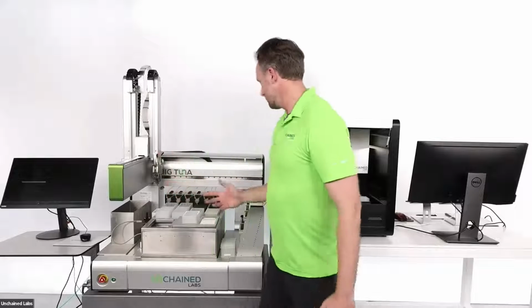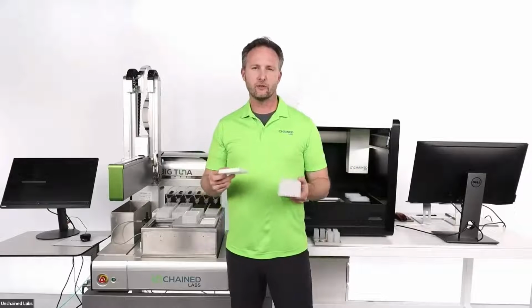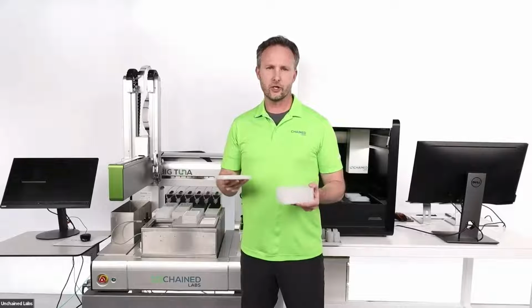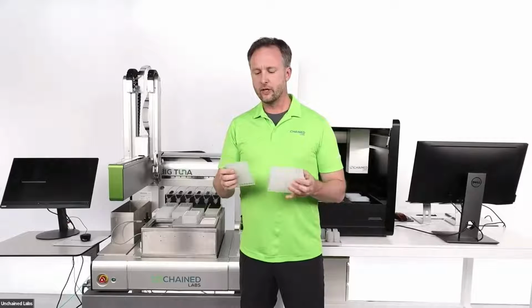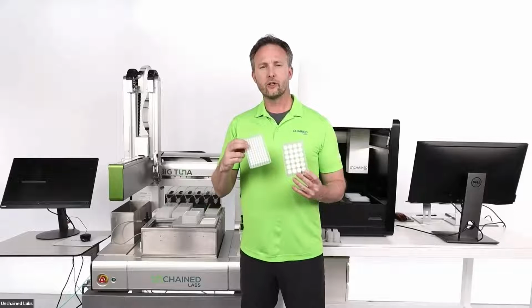So with that, I like to always start with the consumables, right? That's where the magic happens. The consumables that you see in my hand are for the Big Tuna on my right. Big Tuna is our high-throughput automated buffer exchange and concentration solution. As such, it's plate-based. These unfilters are really filter plates, as you can see on the bottom here, which use regenerated cellulose membrane.